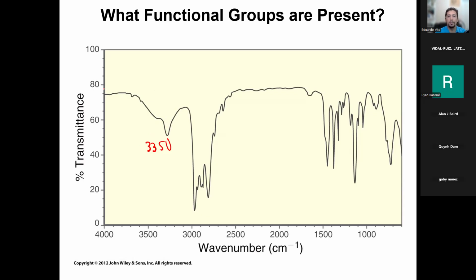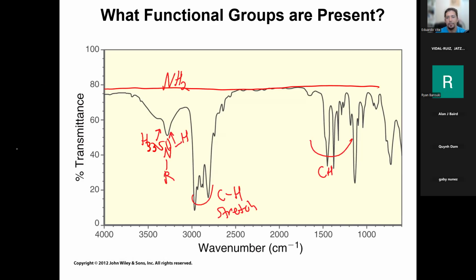But also look at the baseline. The baseline starts at 80. So actually, that's actually weak. It's not very far off from the baseline. So this is still a weak signal. Oh, I don't know what happened there. Okay, there we go. Let's leave it there.